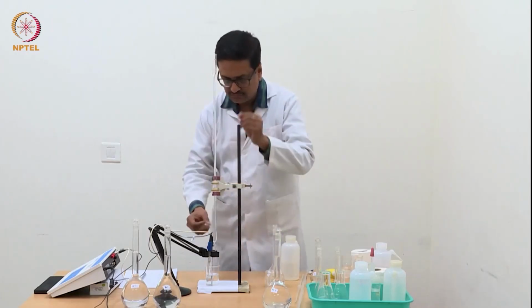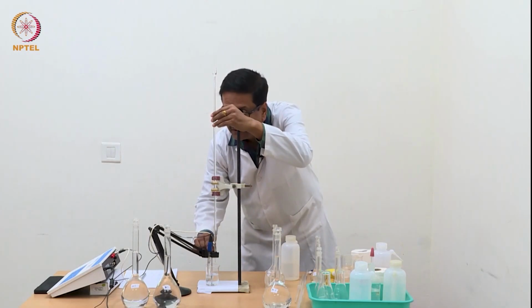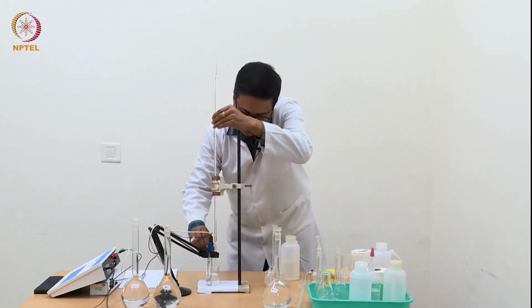So we should keep adding small fractions and check the pH at every step that we add.